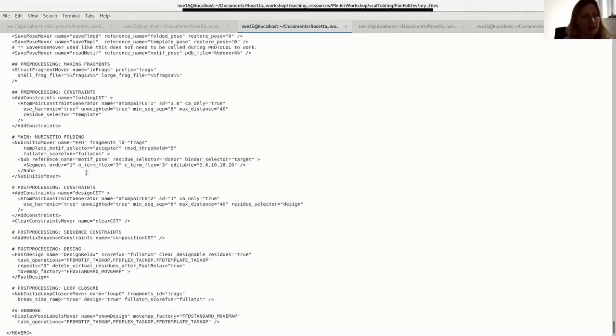And initio means that we are doing basically ab initio folding, and this is also why we need fragments for our tutorial. If you've ever run one of our folding tutorials, you need to provide fragments of the secondary structure in order to provide the folding algorithm a template basis. The fragments are generated in this case not just from the PDB or something; they are solely based on the scaffold protein, which really allows Rosetta to incorporate aspects of how the scaffold protein topology looked.